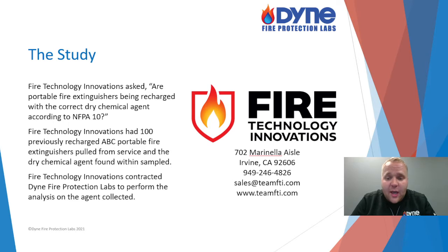So this study began with Fire Technology Innovations, or FTI, asking us the following question: are portable fire extinguishers really being recharged with the correct dry chemical agent according to NFPA 10? To answer this question, FTI had 100 previously recharged ABC portable fire extinguishers pulled from service and sampled the dry chemical agent found within them. FTI then contracted Dyne to perform the analysis on the agent they had collected.